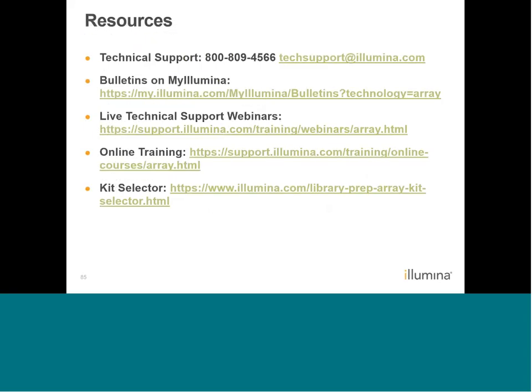Finally, I'd like to point out some resources. We have a number of bulletins that are very useful, especially when talking about things like strand designations in a manifest. We have live technical support webinars. Some of the more useful ones are Infinium best practices, and troubleshooting Infinium data in GenomeStudio. We also have online trainings. For those of you who may be new to Infinium, these trainings really provide a great basis for moving forward. And finally, we have a kit selector, which helps you choose the best kit for your assay.